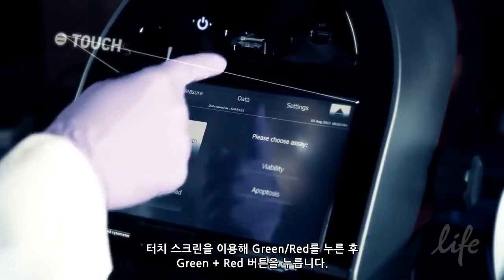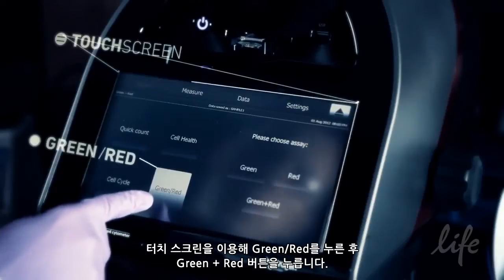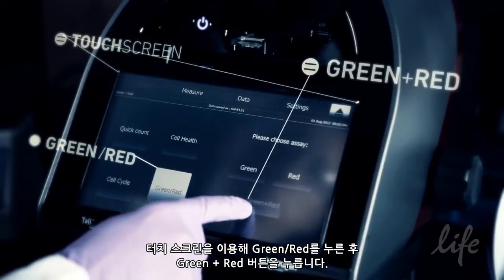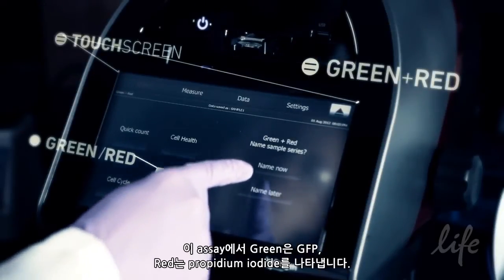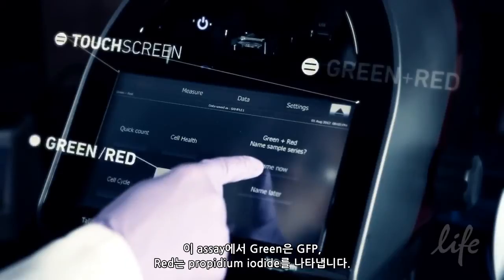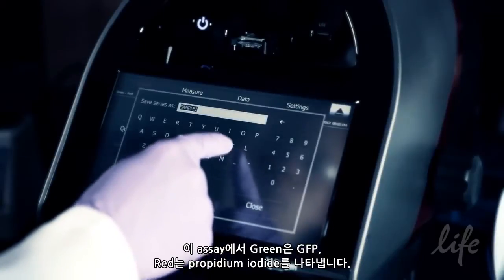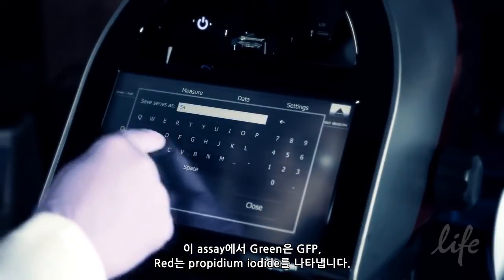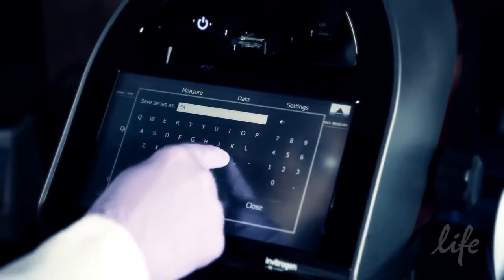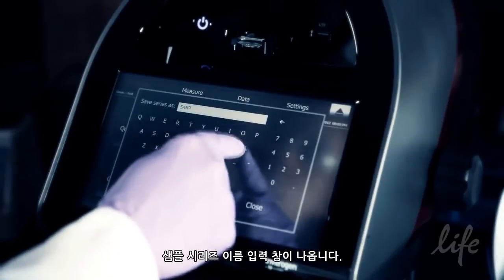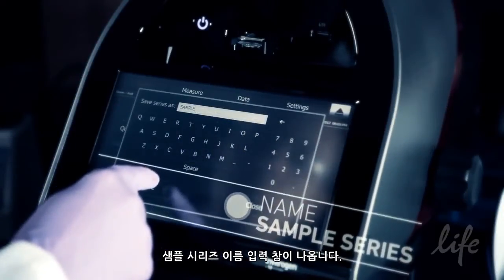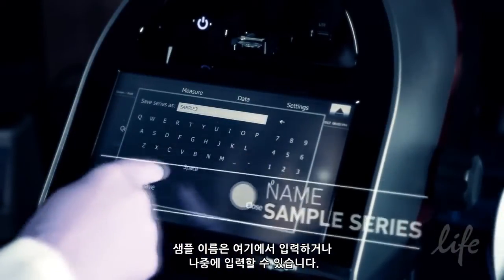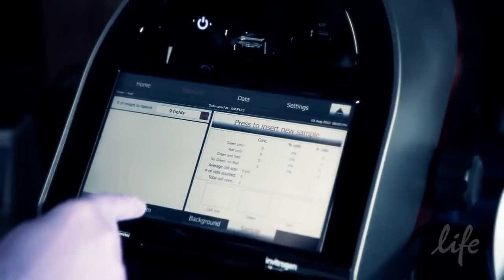Using the touch screen, touch Green or Red, and then the Green Plus Red button. In this assay, green represents GFP while red represents propidium iodide. Follow the prompts to name your sample series — you can name the samples now or you'll have opportunities later.